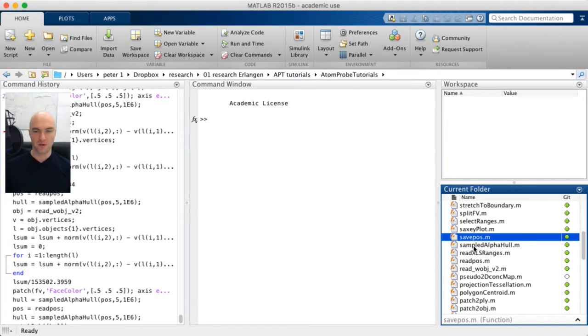There's another one called extended pos file or EPOS file, which contains all the experimental data as well. We're going to use that probably sometime later during the analysis series, but they can also be loaded through the same routine. You'll see that.